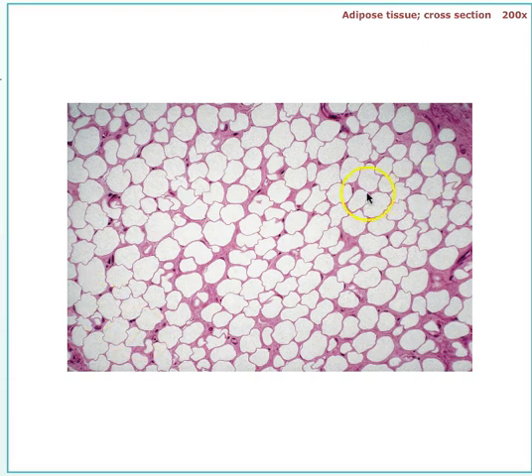There we go, adipose. So here's adipose, which is fat. This also falls in the camp of loose connective tissue. Adipose, again, is fat. One of the telltale signs of looking at fat is these giant white circles, almost like it looks porous. And that's because there are hardly any organelles inside of fat cells. Why does it need organelles? It's just there for insulation and energy.